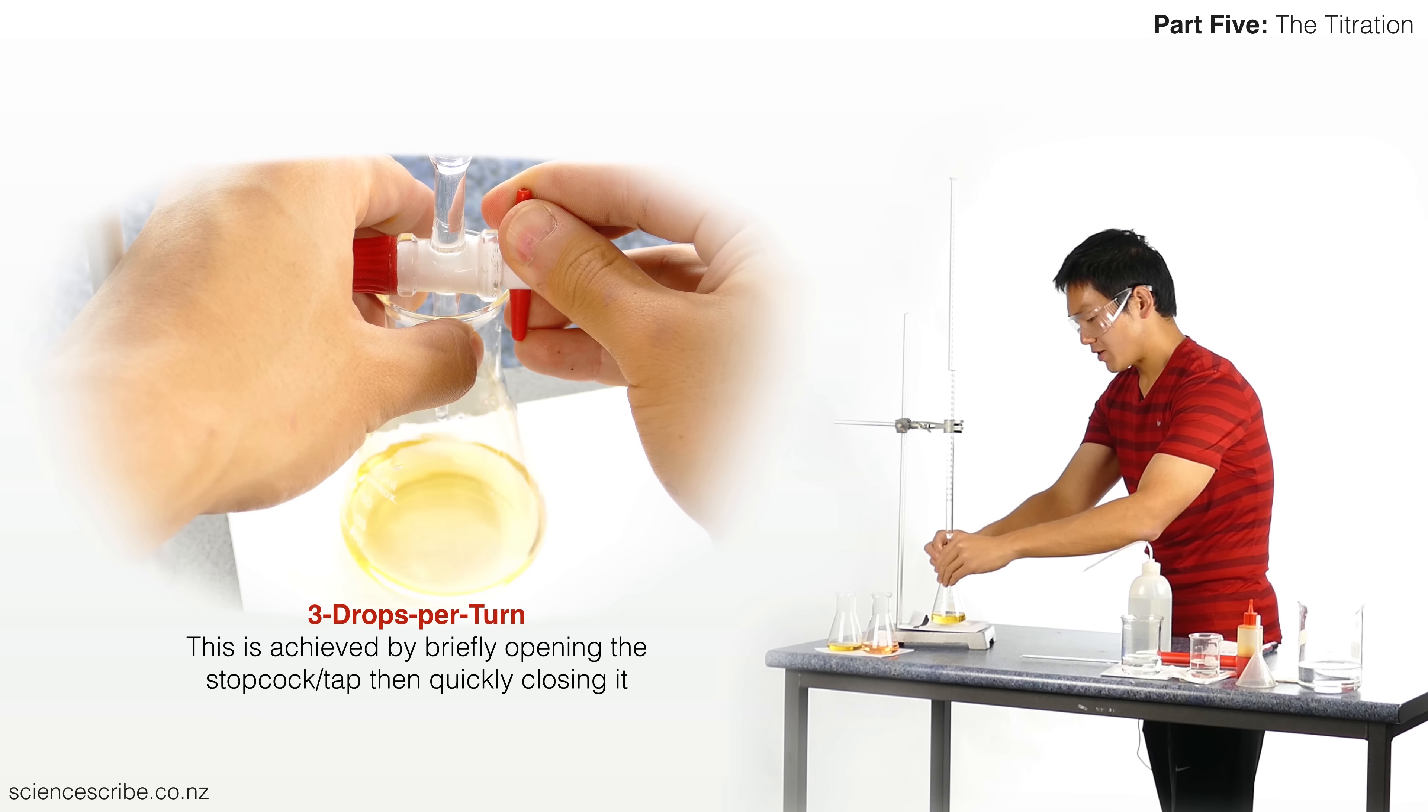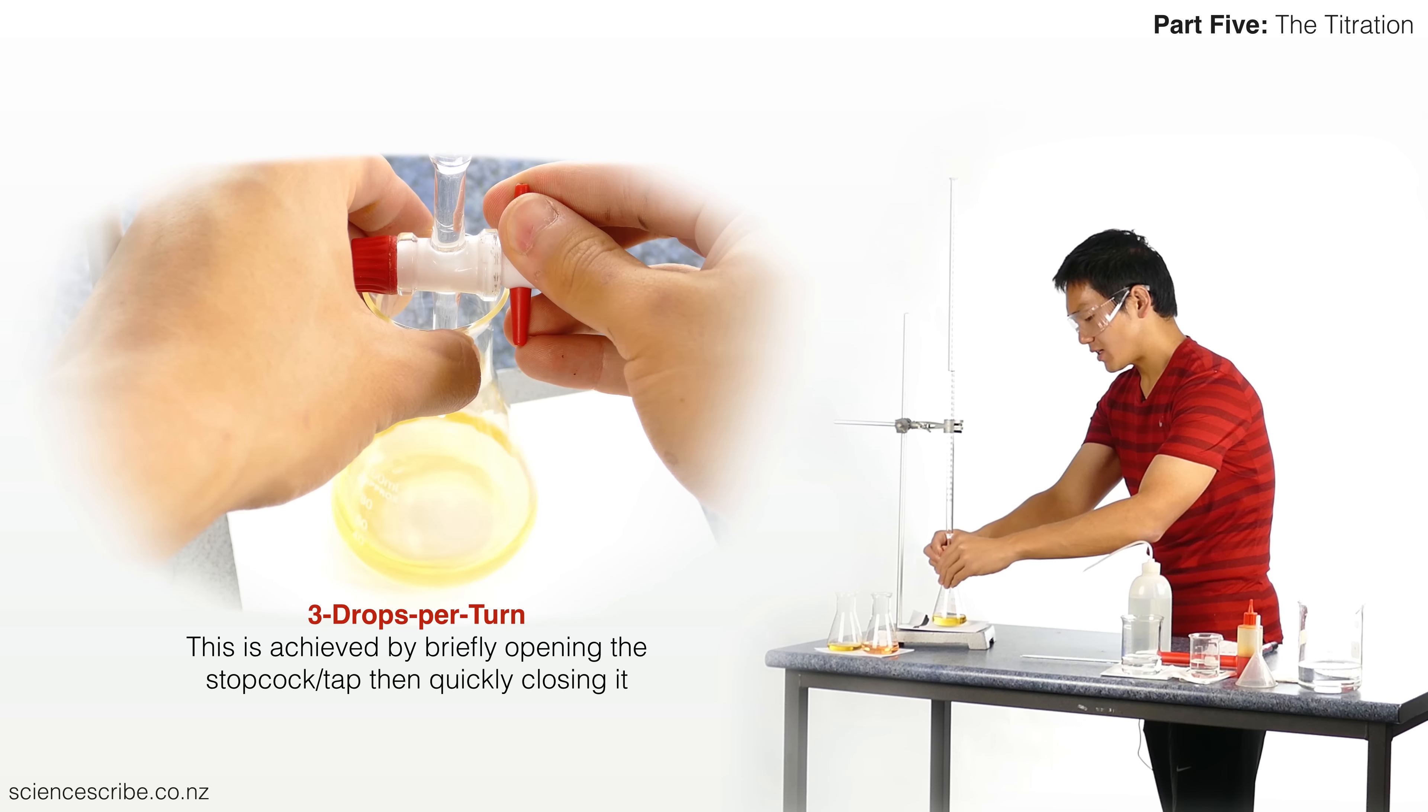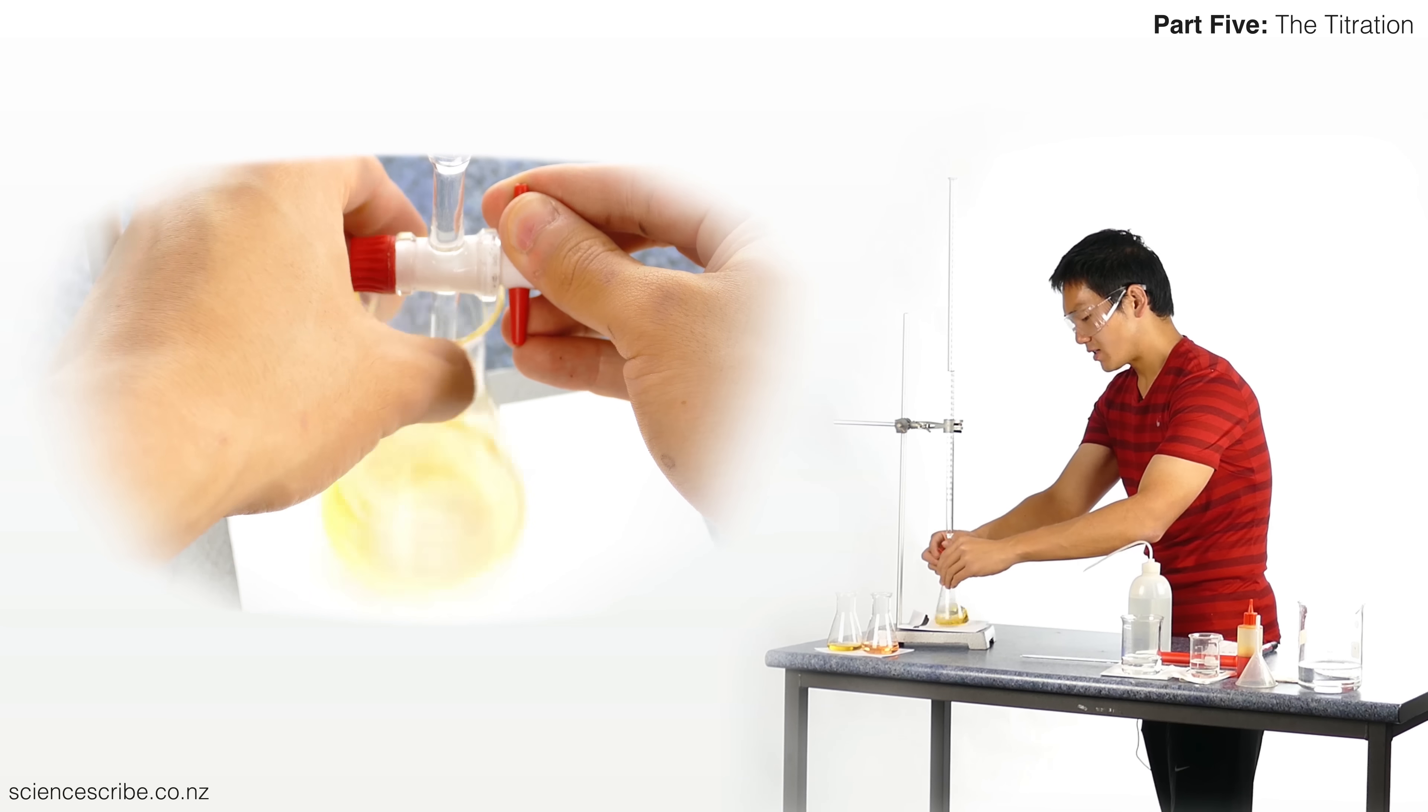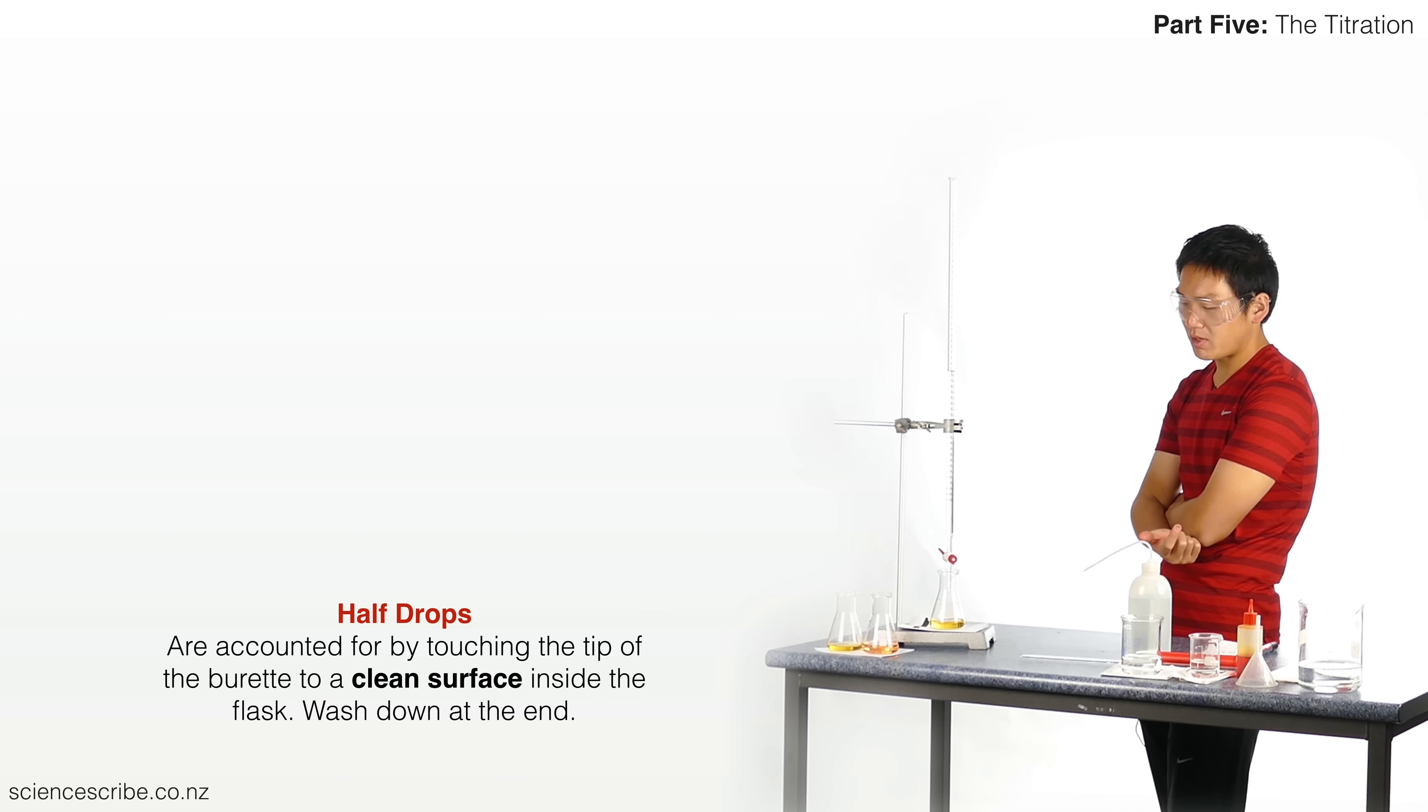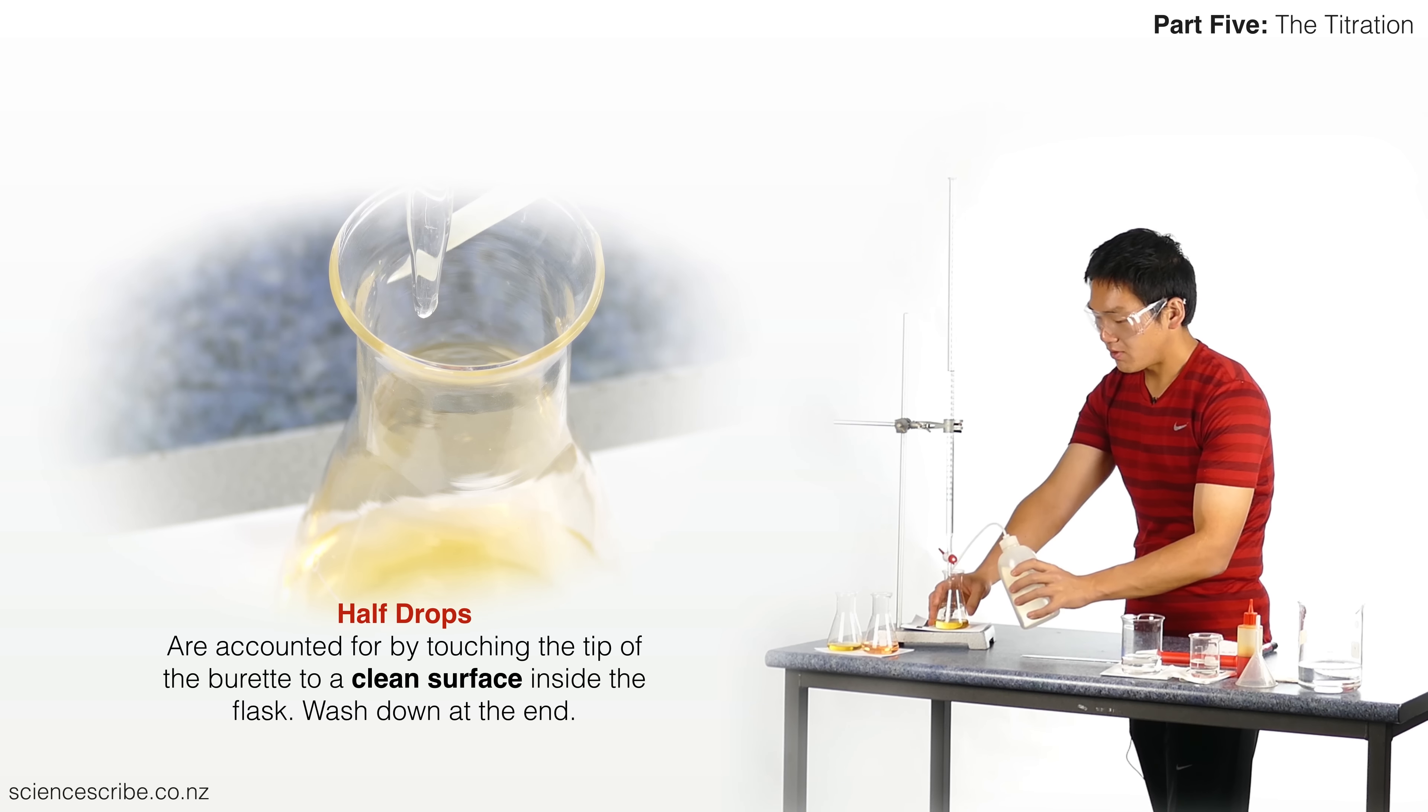I'm going for three drops at a time, and what I'm going to do is pay very special attention to how long it takes for that pink color change to dissolve or disappear back to yellow. It's taking a lot longer. I still have a drop hanging off the end of my burette, so at this point I'm thinking maybe I should start adding just a single drop at a time. I've got a half a drop hanging off, so what I want to do is just touch that to the clean surface on the side of the conical flask and then I'm going to rinse that down.